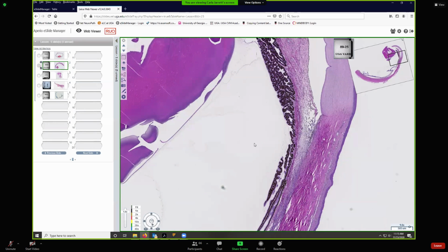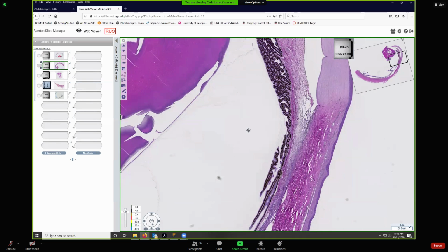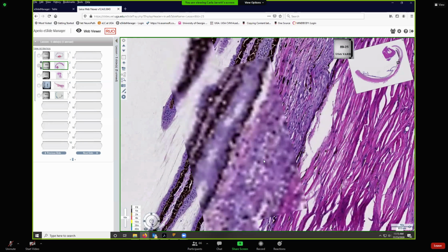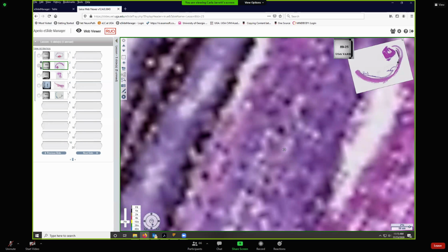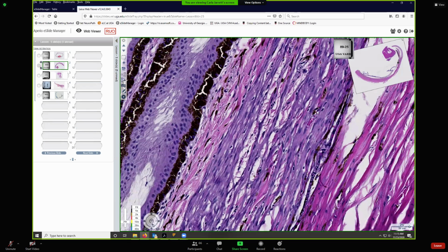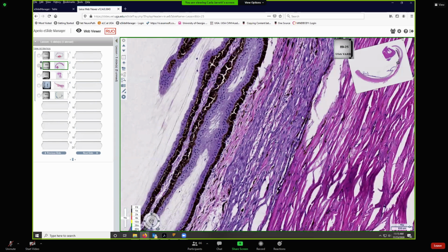Okay, so what was default? We have our ciliary muscle right here in this herbivore. These are meridionally positioned. That means along the long axis, on a sagittal plane of an eye section. These are smooth muscle cells, and by default it is relaxed.